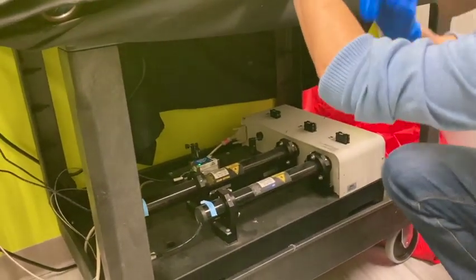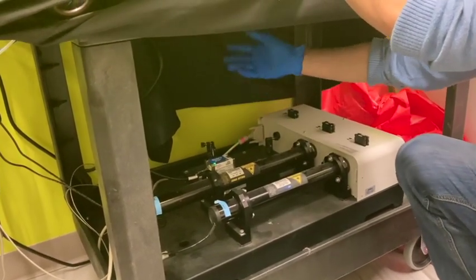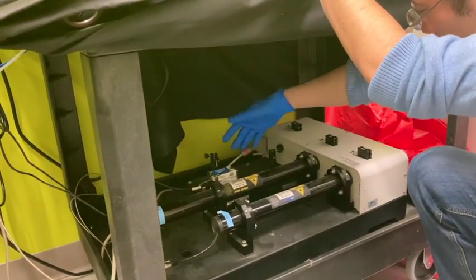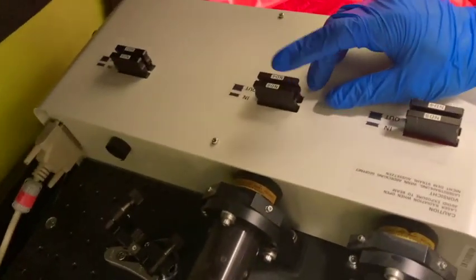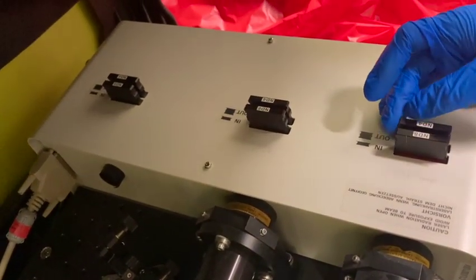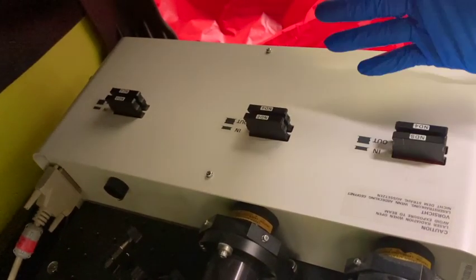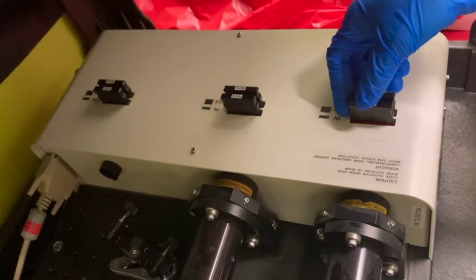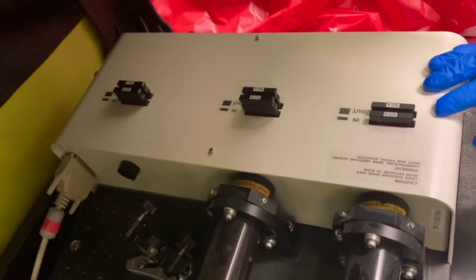Once we have this ready, let's take this apart and see what happens down here. So you can see we have 3 different lasers, red, green, and blue. It's still blinking, which means it's still warming up. And then we will see, it's going into this chamber, and we have different neutral density filters. We have OD of 4 and OD of 8 for every channel. When you put it up, it is not in the pathway, which means the light will go through totally. Then you push it in, we decrease the intensity by another decade.